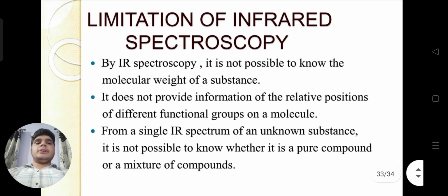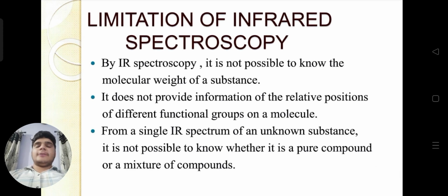The limitations of infrared spectroscopy. As we know, every instrument or every technique has some limitations. By IR spectroscopy, it is not possible to know the molecular weight of a substance. We can only find which substance is present. We can't measure its quantity.